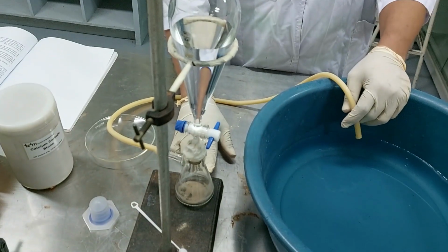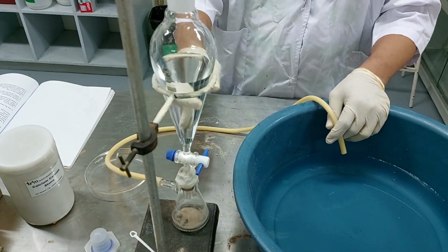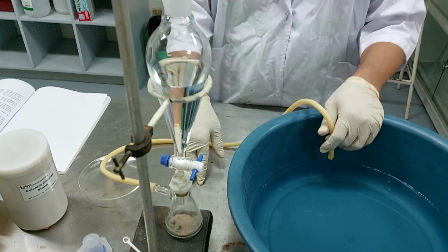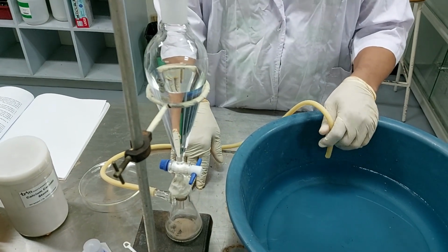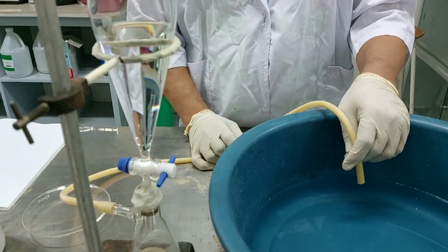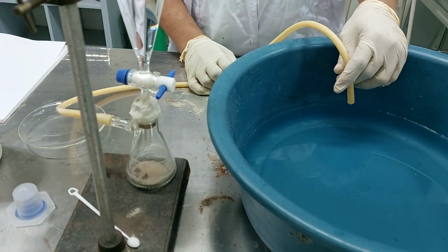So this is our calcium carbide, as you can see it is in the glass, and we have to react this with water. The reaction will produce acetylene, which is a gas. So we have to collect the gas by water displacement. The byproduct of the reaction is calcium hydroxide, which is white, and it is also called lime, which has medicinal application also. It can be a neutralizing agent also.